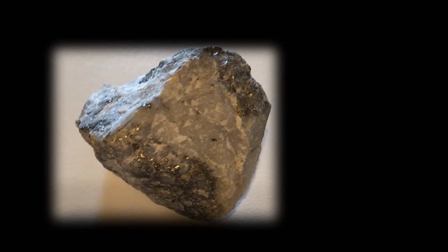Well, this concludes part 10 of this series, titled Classical Chemical Assay for Small-Scale Miners, Prospectors, and Hobbyists. In this presentation, I talked about the crucibles used, along with some of their applications. In part 11, I will be discussing briefly some of the special treatments used for those hard to decompose and refractory type samples. Now, I tried to present the information in a way that anyone without a chemistry background would understand, and I hope that I succeeded.